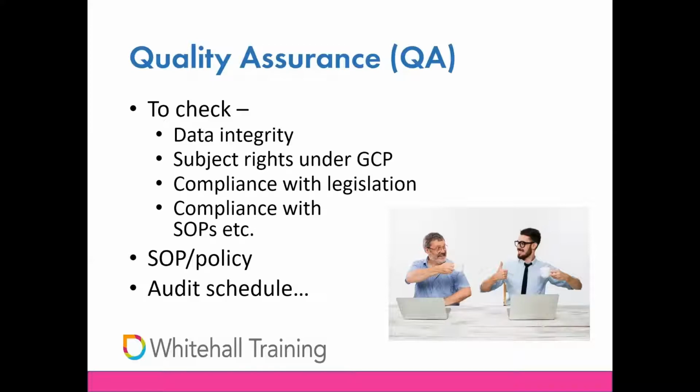How labs do it depends very much on the scale and the scope of the work they're doing, as well as the resources they've got available. But whatever the QA activities are, they need to be documented in standard operating procedures or policies. And it's a good practice to maintain audit schedules to indicate planned and performed activities.